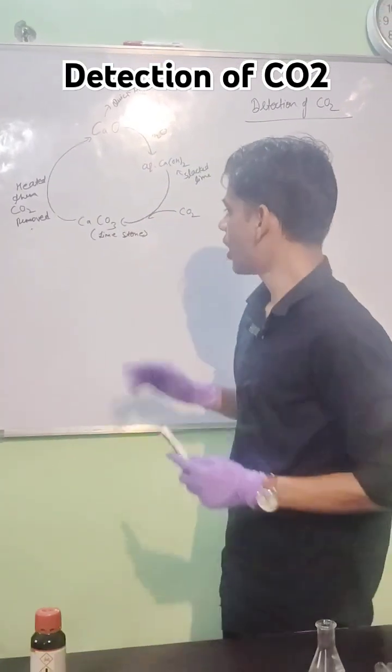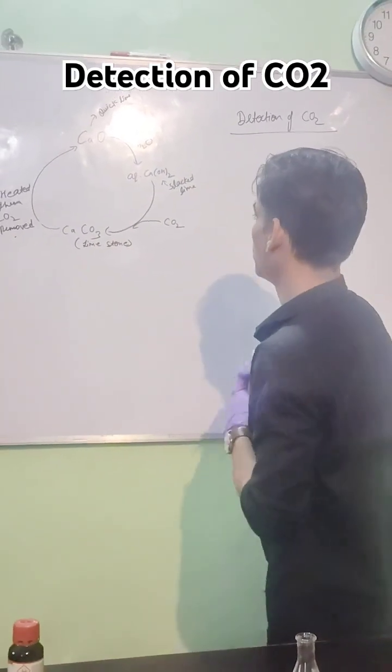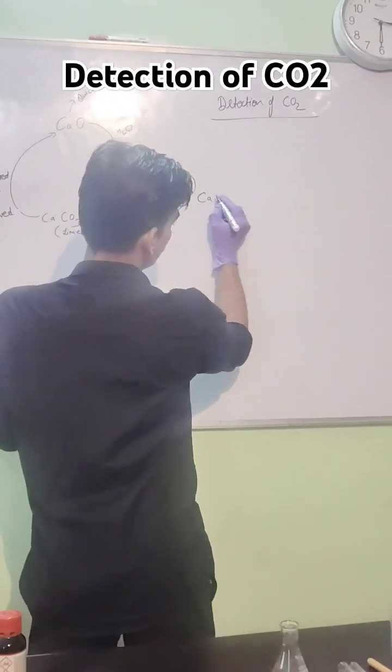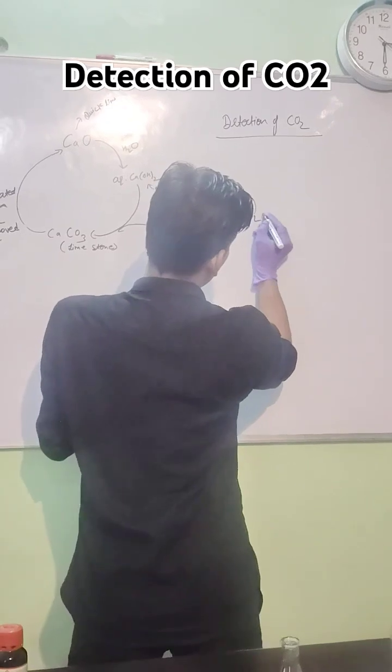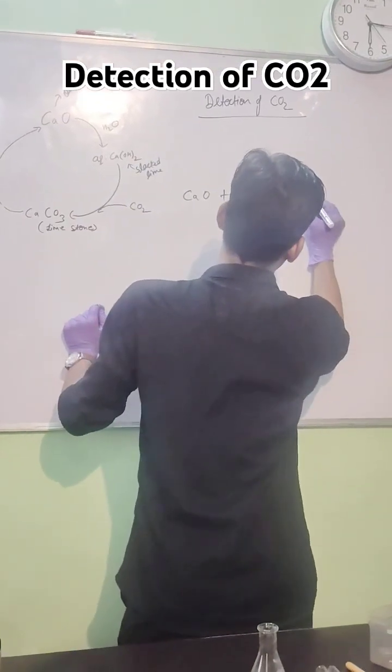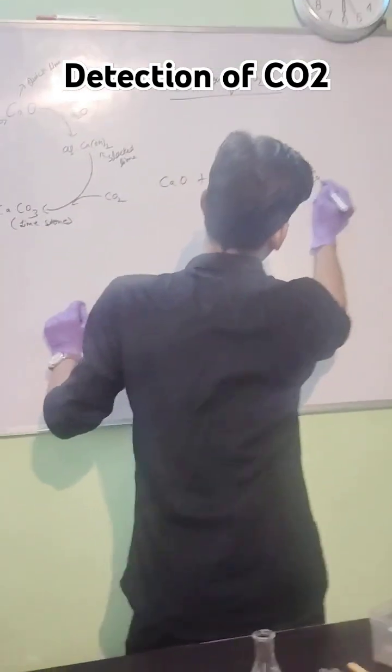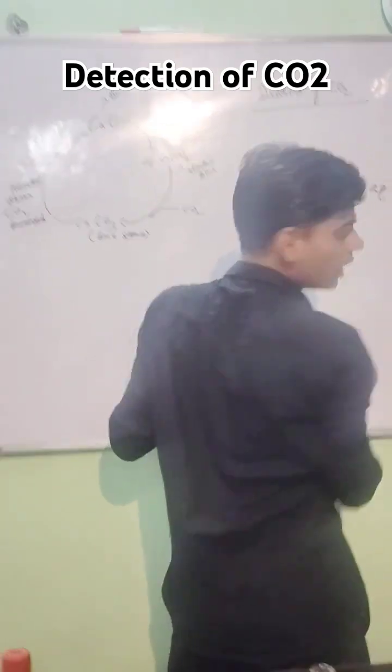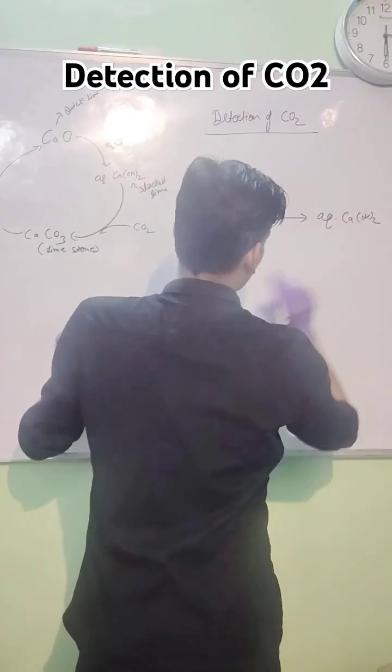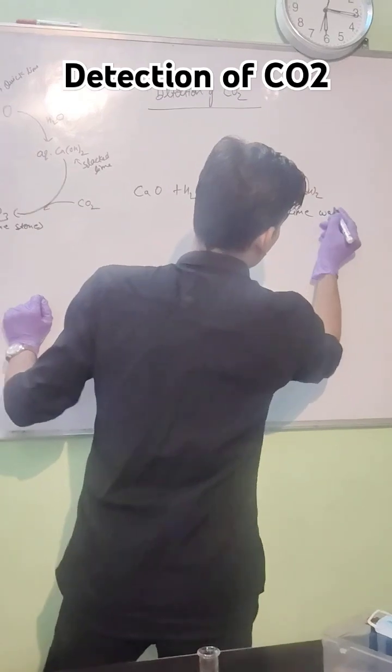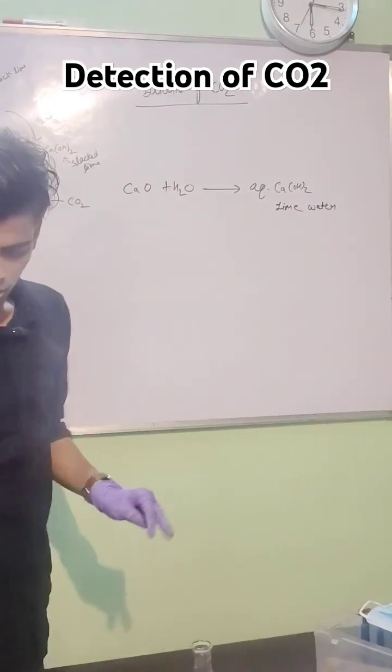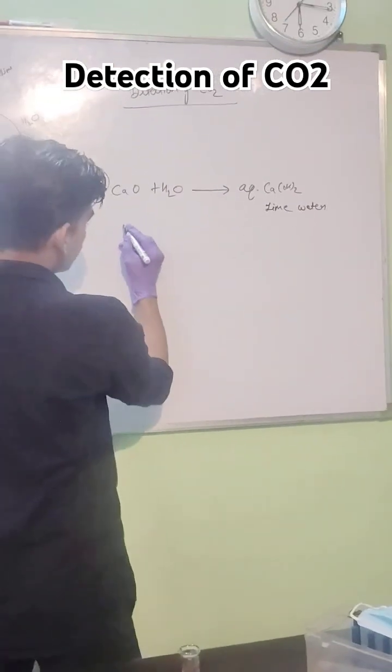First of all, I am going to show the reaction. This is calcium oxide. If we mix it with water, then what will happen? It forms aqueous calcium hydroxide. This is known as slaked lime or you can say lime water.